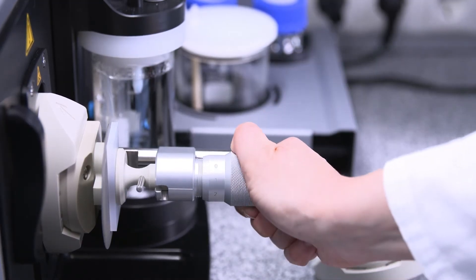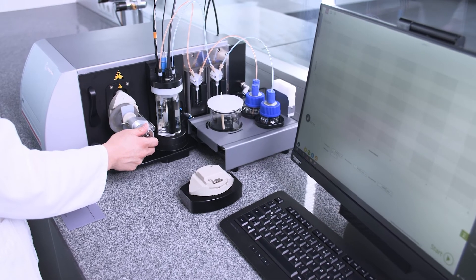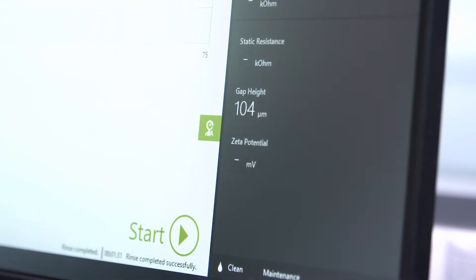After the gap height of the capillary channel is adjusted and the basic parameters are set in the software, you can start the measurement.